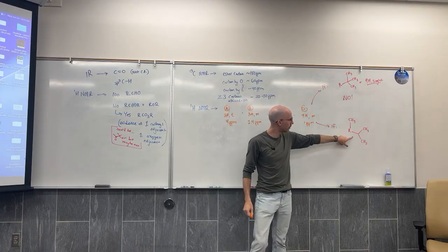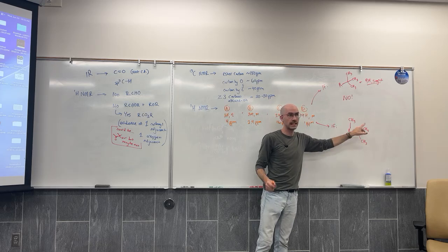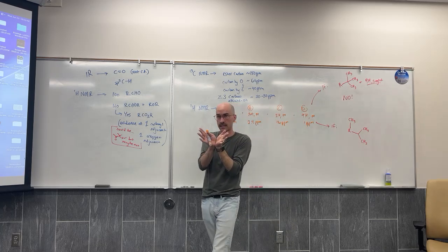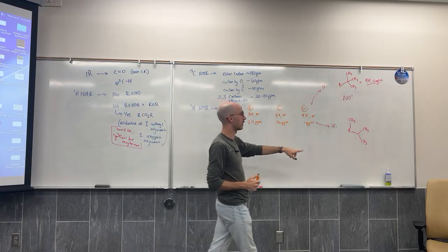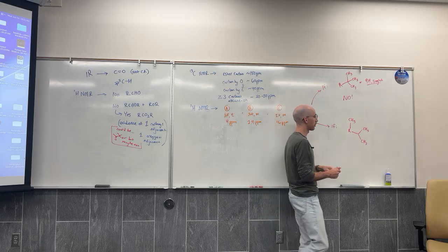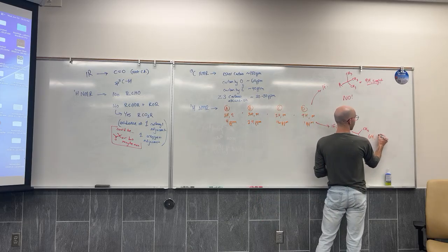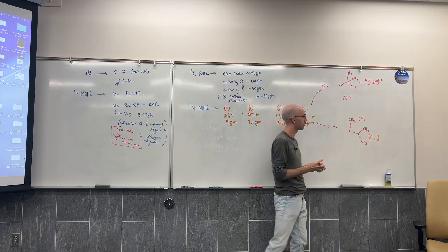Okay, well, what about this 6H? If they are connected identically and they're connected by this carbon, how many hydrogens at this carbon? So what signal would that give? How many peaks would that give to this signal? 2 peaks. So this would give a 6H doublet, and this would get a 3H.